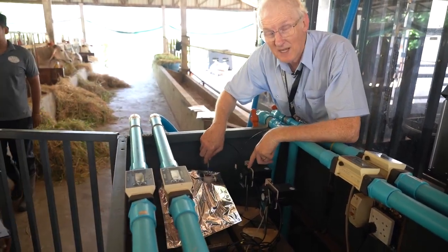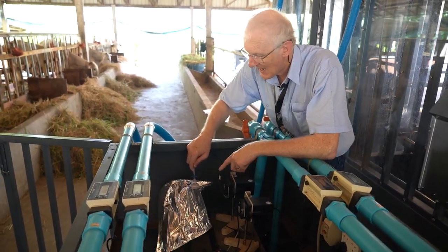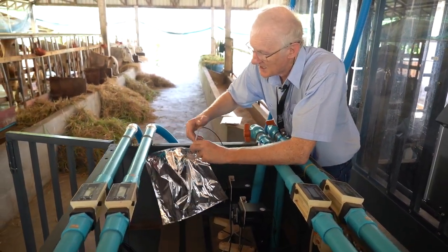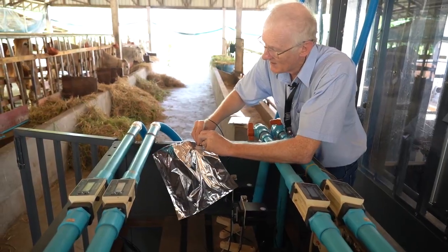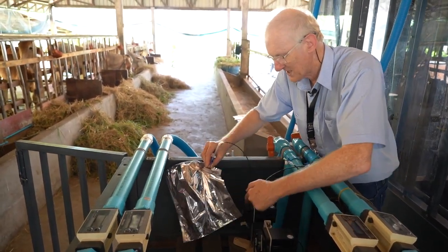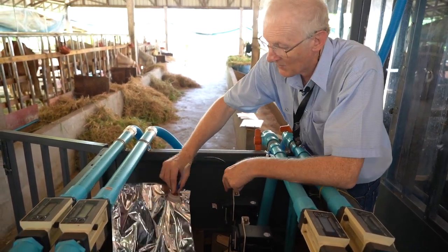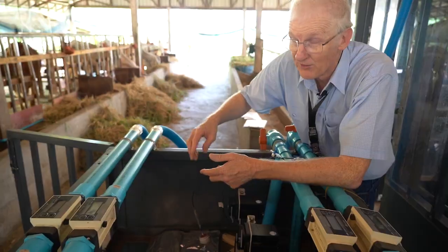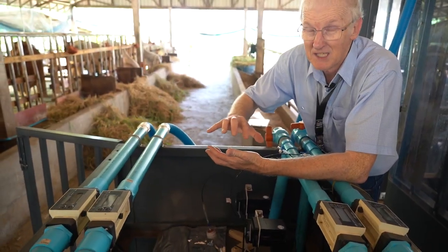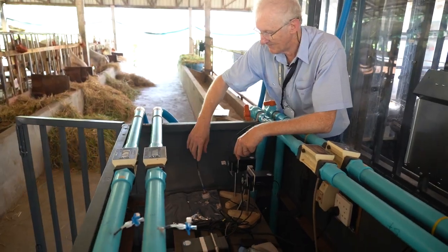And we know that we have set this to suck at about 2 mils per minute. And that 2 mils per minute, as soon as I open this bag, will start to get pumped from here. It'll draw it down from the sample line through the peristaltic pump and into the bag. So when we come tomorrow morning after 23 hours, that bag should be nice and puffy like a pillow, but not pressurized like a balloon.